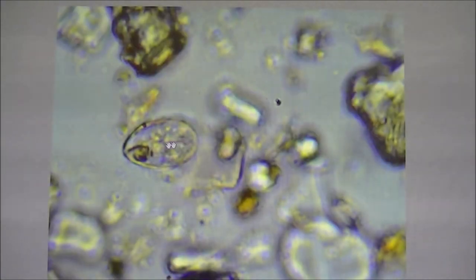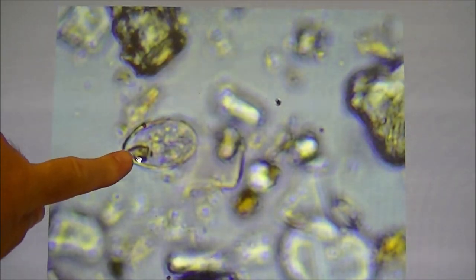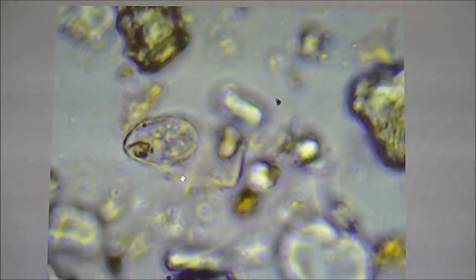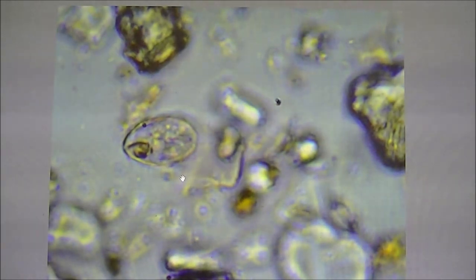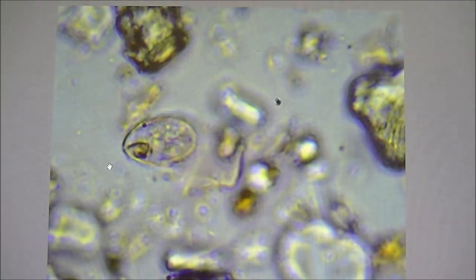So I've been searching for the last maybe two hours now, and I came across this. Where the little hand symbol is in the middle of your screen, this egg-shaped object that we have here, this is a protozoa, which is awesome to find. It's not living anymore because it's been underneath the light and it probably killed it off or it's slowing down. But inside the belly of this, this is the mouth here, that will bring in the bacteria which you can see that's on the inside. They're all dead because it's digesting them of course, and this would move around, and it just acts like a little sucking funnel that brings in this living bacteria and will eat all that.